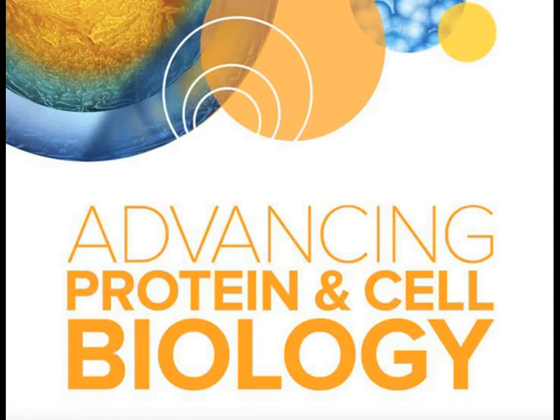Right. There's a question, I'm just going to go back to Oksana. Did you use air or water or oil objectives for your assays? Actually, it was all air objective. Yeah. No oil in this assay.